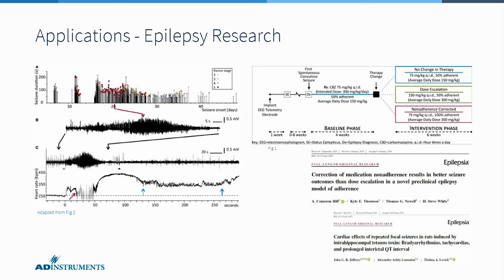They were able to implant the telemeters right at the beginning, record some baseline, then induce epilepsy in their animals, carry out a dosing regime, and then split their animals out into 3 experimental groups for the final part of the experiment. So they were able to collect lots of data from each animal and get really good statistical power.